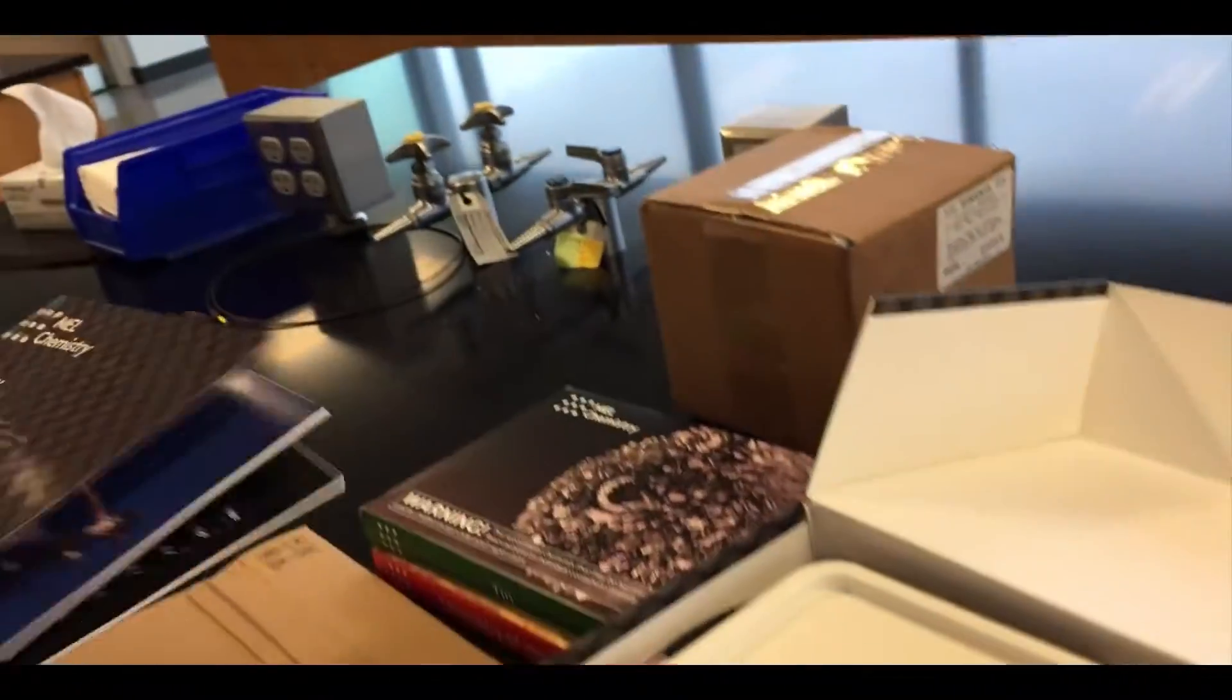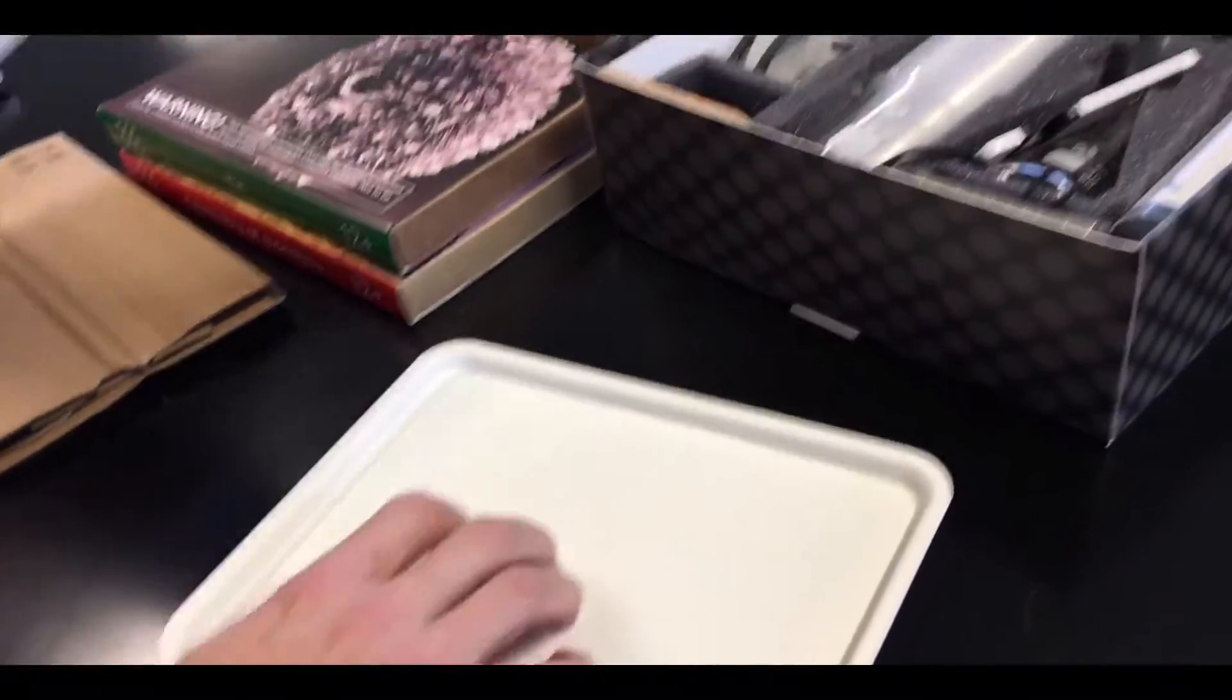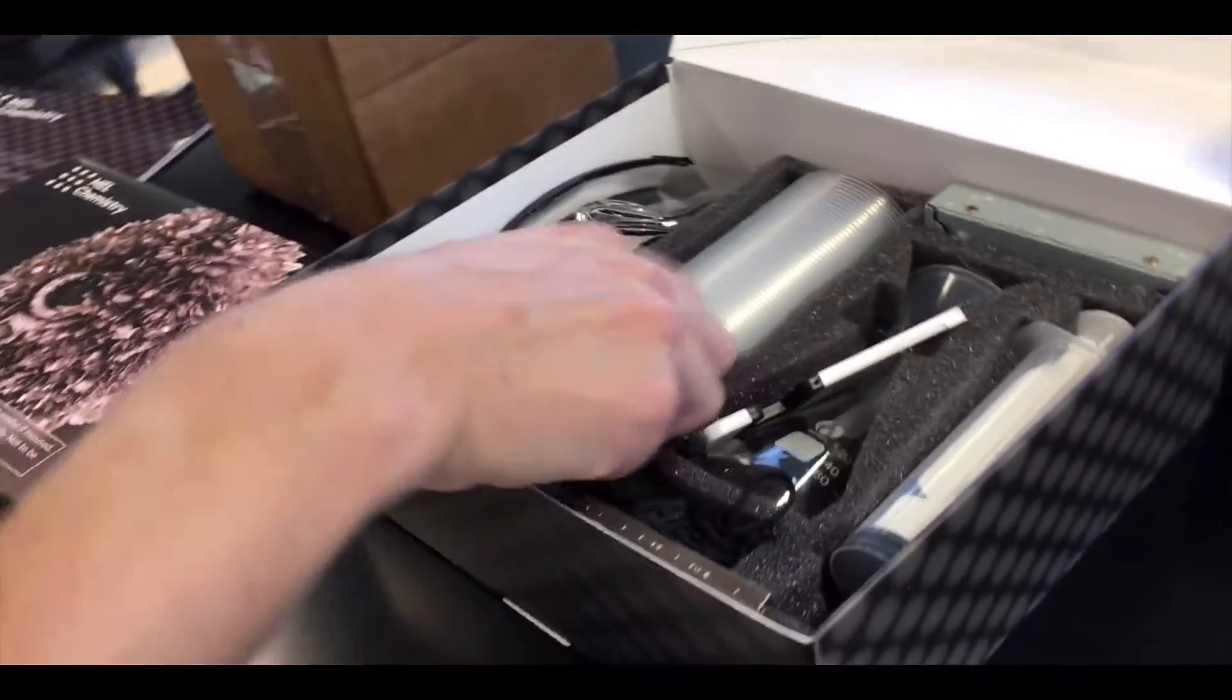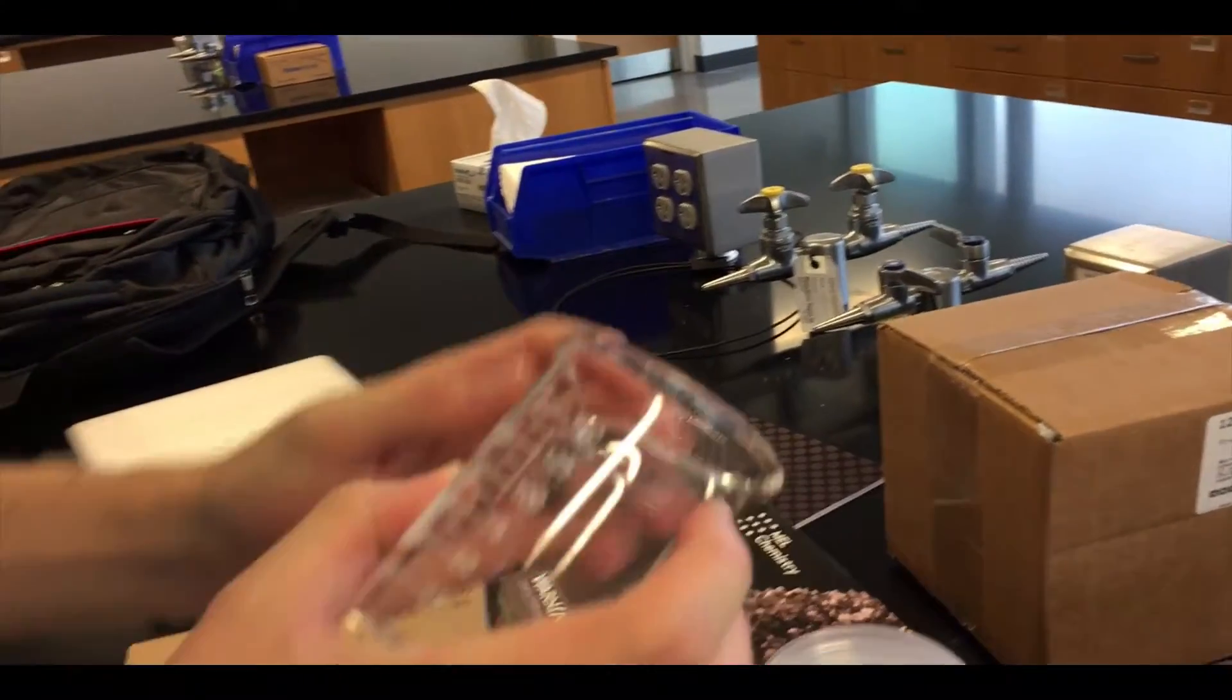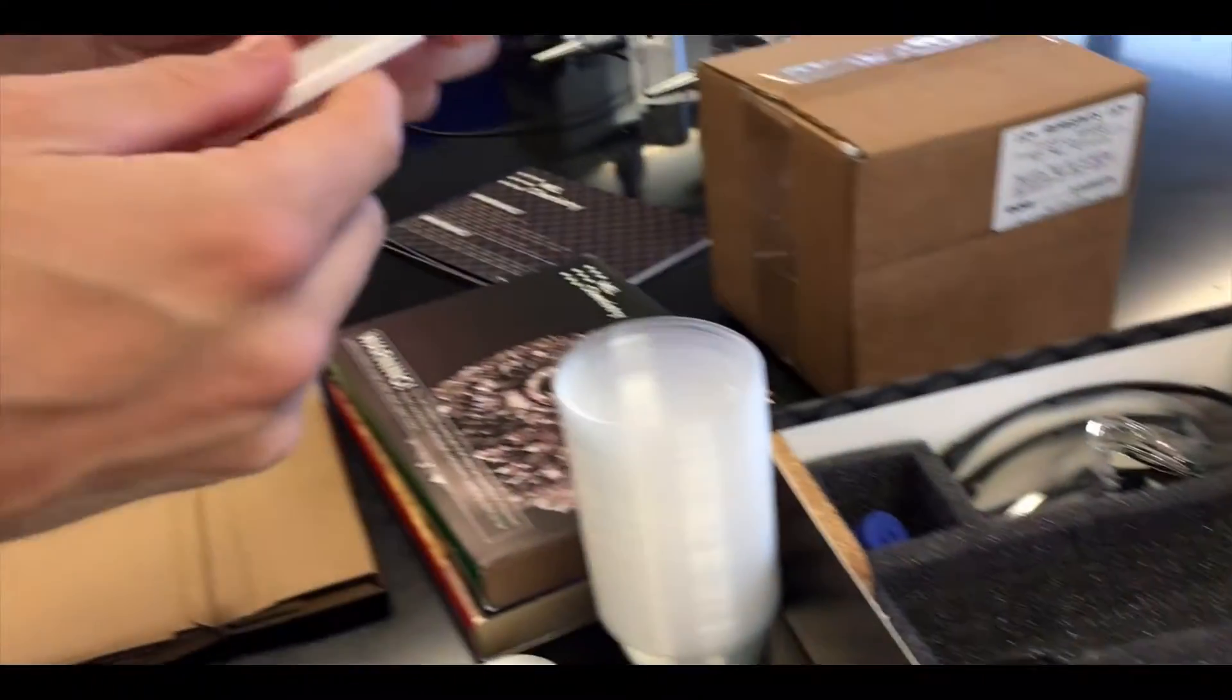Okay, nice drip tray, essential piece of equipment there. We've got plastic cups, we've got a nice beaker here. I like how they put approximate measurements on there just in case you wanted to use it for specific measurements.